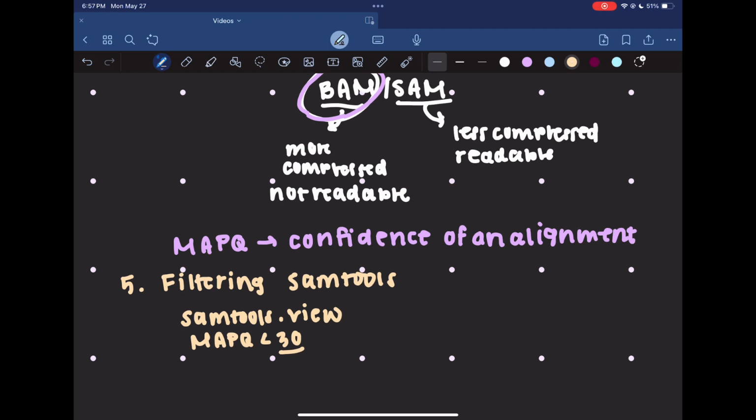Now, for the majority of my reads, it was either a MAPQ score of like 0 or 1, or I had a MAPQ score of like 60. So 30 maybe was a bit of an arbitrary threshold, but you can look at your own data and see, do you have a bit more of a gradient in terms of your mapping quality? I think 30 is pretty standard from what I had read. So it's definitely a safe metric to use, but you could set it higher if you see more of a gradient and you want to restrict to really high quality reads. You could set it lower if you're feeling like, well, that's just going to cut out all of my data. It's definitely a bit of an independent process to decide that map quality score.